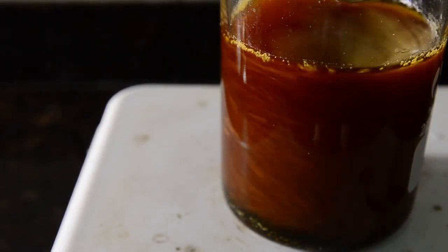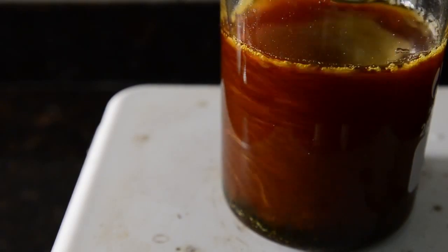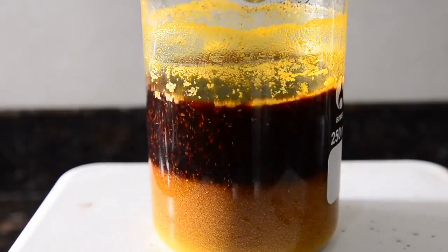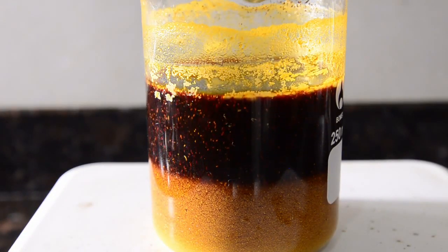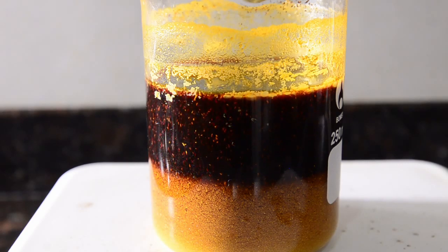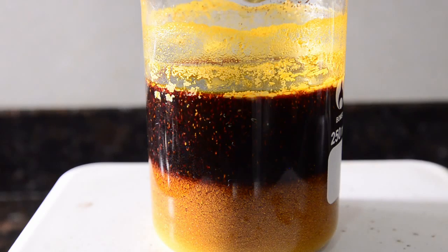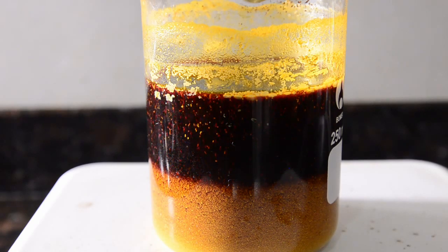The mixture should be left stirring for 2 hours, after which you'll see the solid iodine at the bottom of the beaker slowly dissolve and react. After 2 hours, we're left with a yellow solid and a dark red solution. There's still some free iodine in here, and also some unreacted vanillin, so we need to clean our product up.